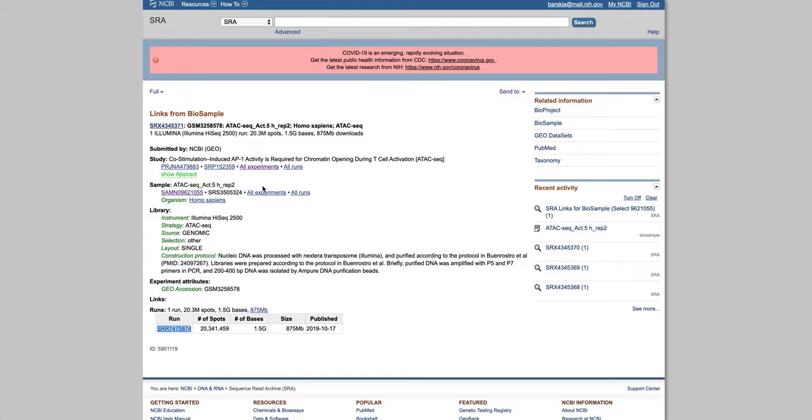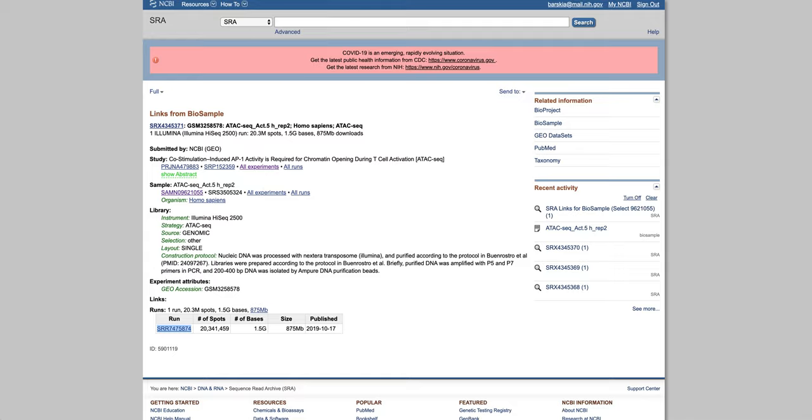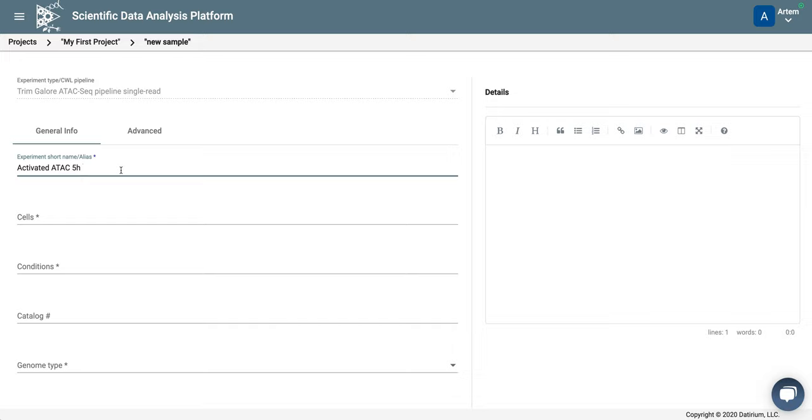So let's go back into SIDE-UP. So first we give experiment name, so this will be activated, ATAC, and 5 hours, and this is replicate 2.